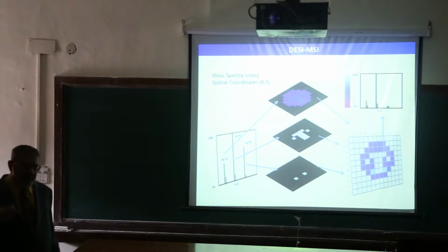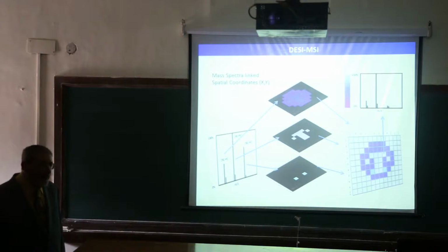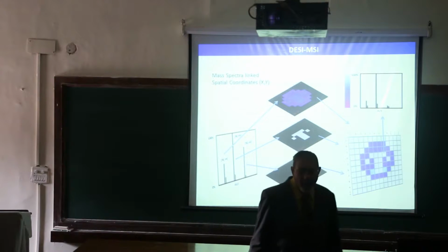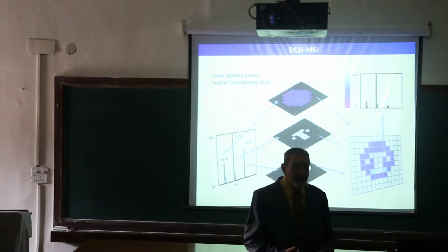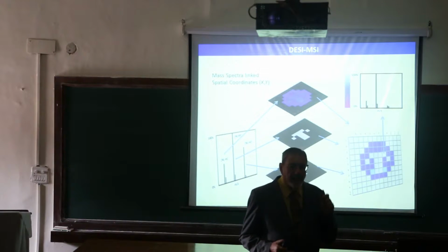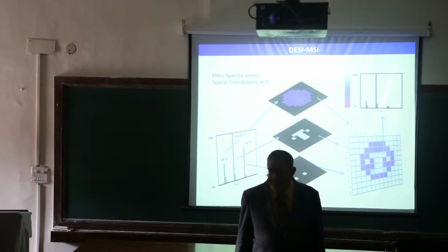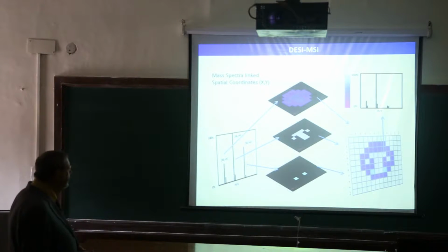It's bigger than a droplet because I can't control the droplet always going to the same spot. The size of the pixel tends to be about 200 microns by 200 microns. To get you to understand that, a human hair in diameter is about 100 microns across. Happily, while this is not the best resolution I would like, and I can talk to you later how to make even better resolution, this is comparable to the knife that the surgeon has. Okay? So it's okay. This will be good enough for what we're doing.